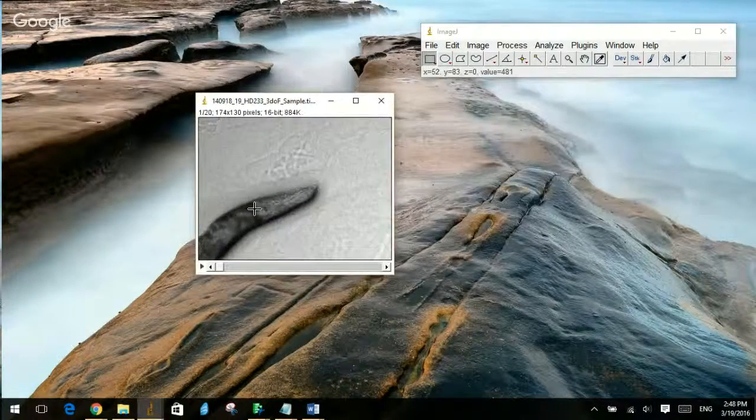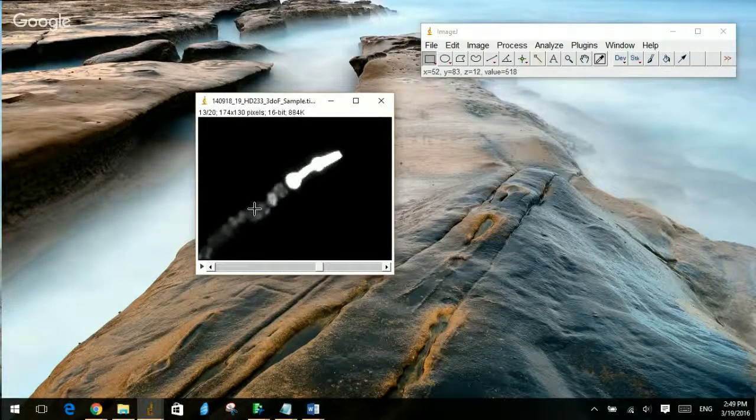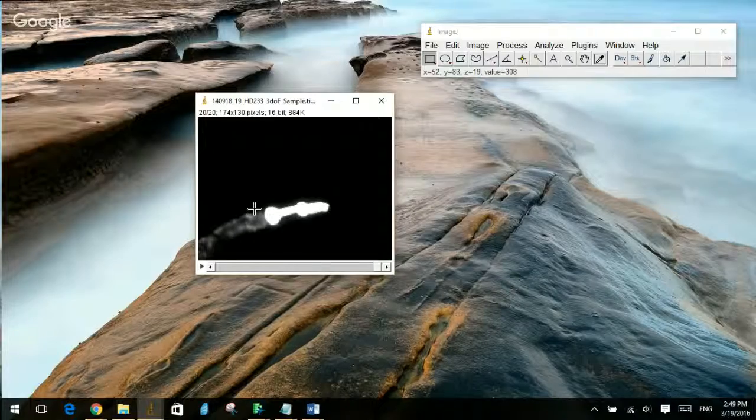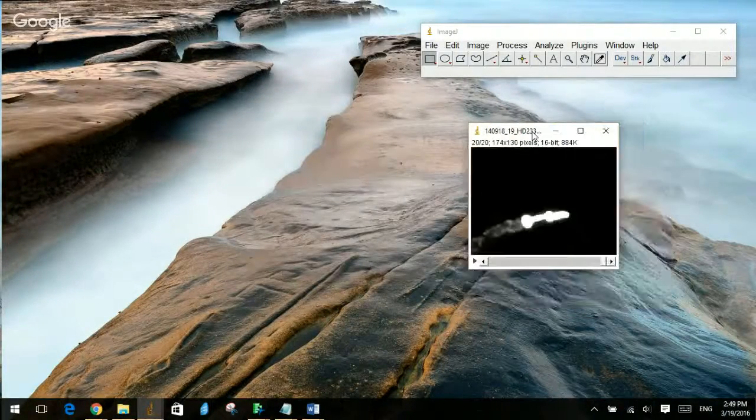So we have 20 images total. This first image here, these are all C. elegans that are 3 days old. And this image here is taken under transmitted light. This one here is taken under 410 nanometers. This one is 470 nanometers. And then 4 and 5 are just copies of 410 and 470 respectively. So we have 5 worms total, 4 worms, sorry. 4 worms, 20 images. And there it is.